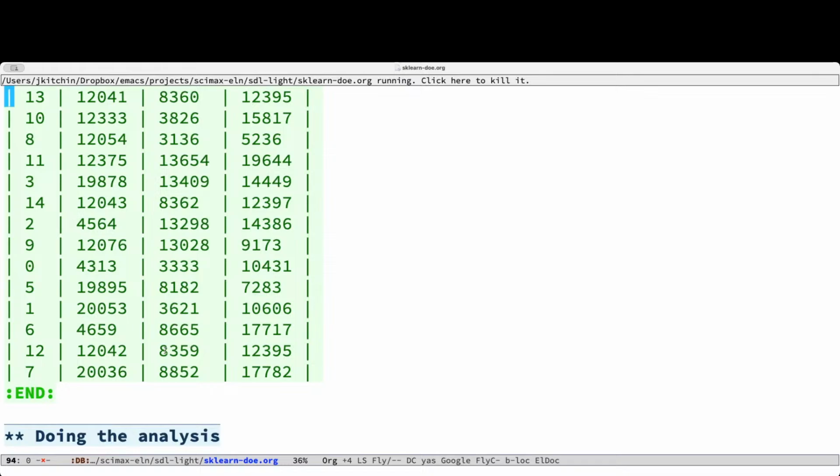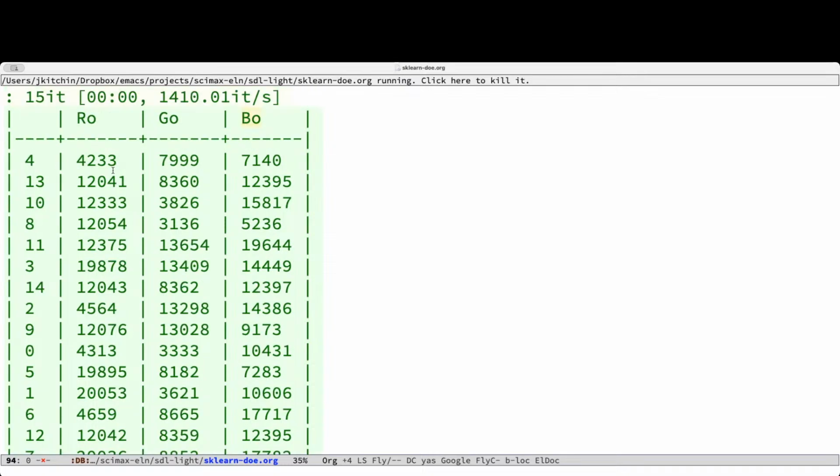Now, if you weren't doing this all in code, if it wasn't all Cloud Lab, you might have to create an Excel sheet, and you might enter manually some measurements, and then you might use pandas to read that Excel sheet to generate this data frame, but I'll save that for another day maybe.